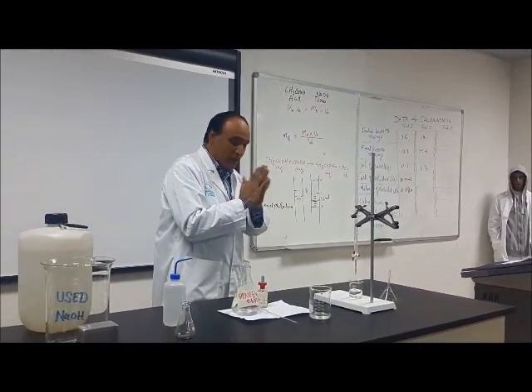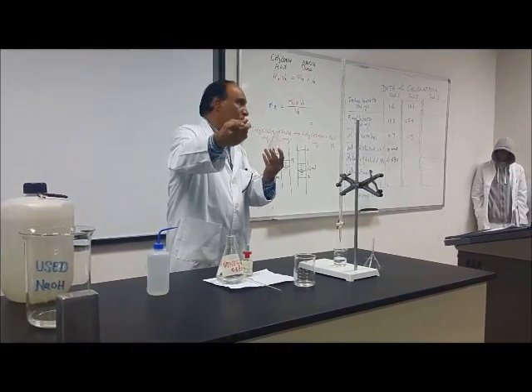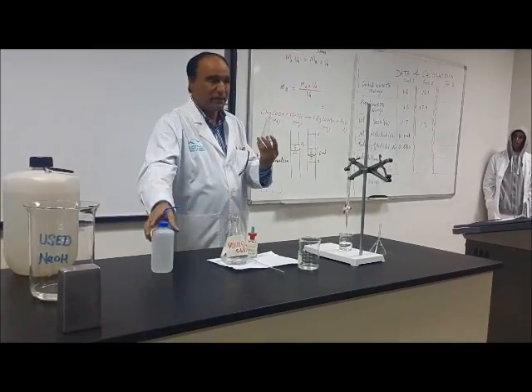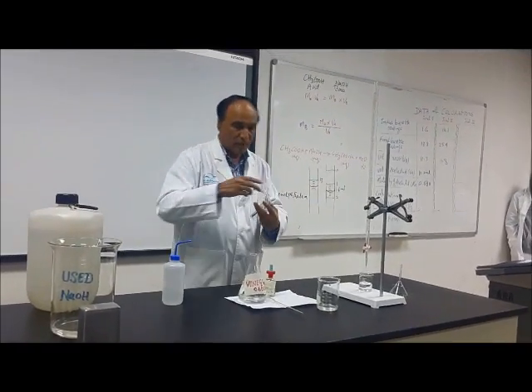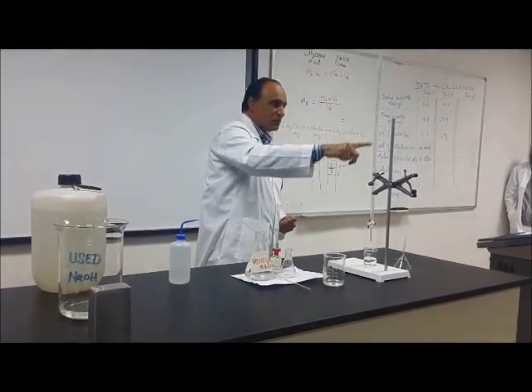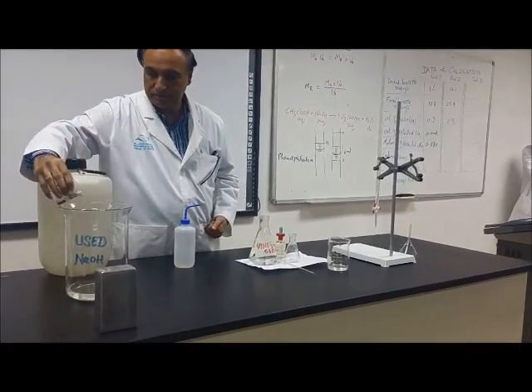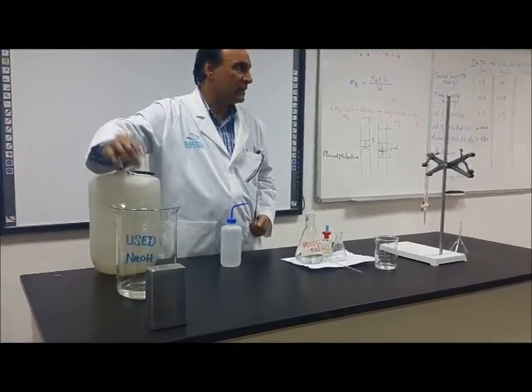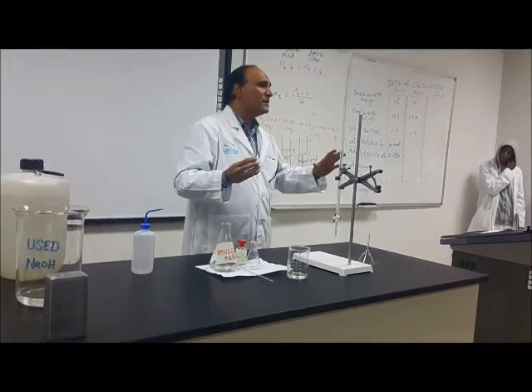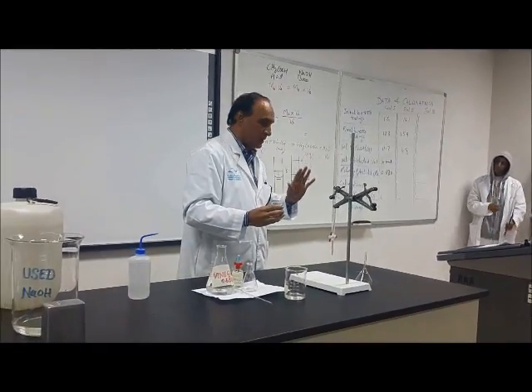Did you understand? Yes. This flask now is washed with the tap water. My experiment is finished. Should I wash it? No, another student will come and do it. Look, here is the sodium hydroxide which you put back. Should we wash it with soap? No need, because it is not a precipitate. It will go with tap water.